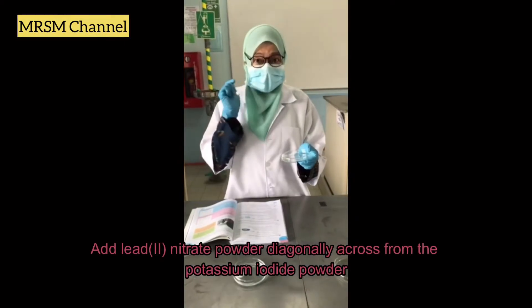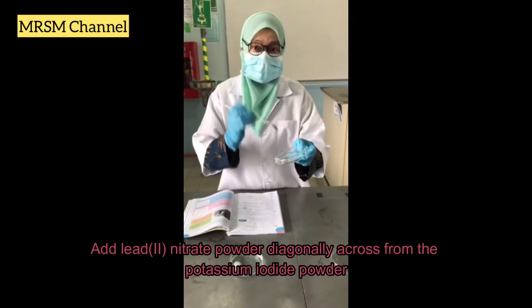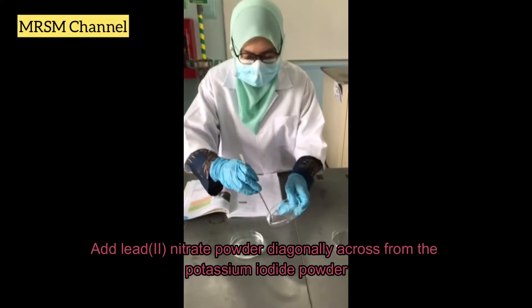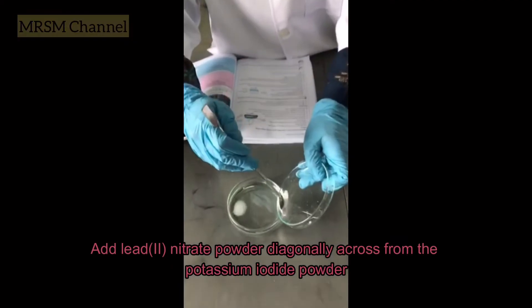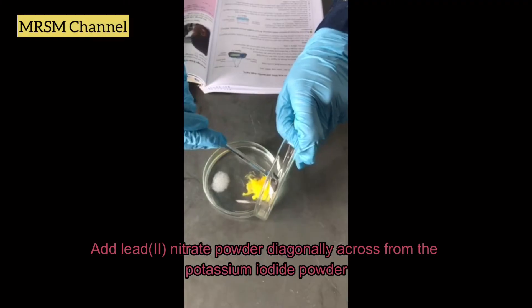For the fourth step, you have the lead nitrate powder here. What you should do is place it diagonally across from the potassium iodide you placed just now.